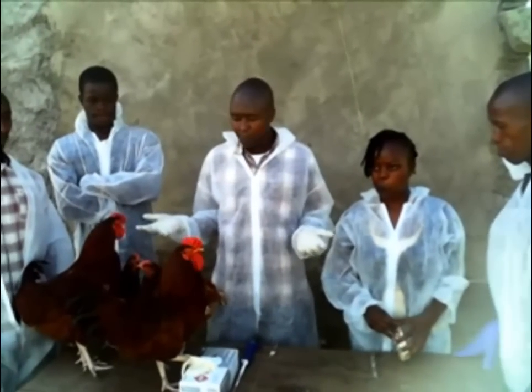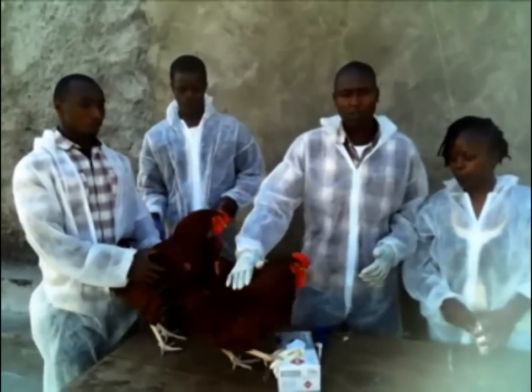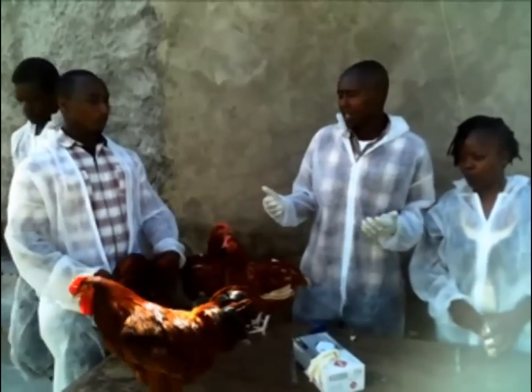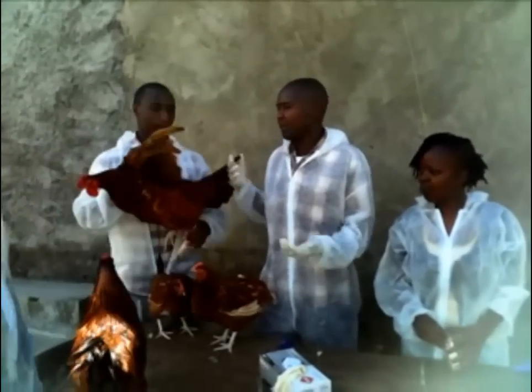So now let's go. First, get your cocks from the cages. Make sure that when you are handling the cocks, you minimize the stress, because if the stress is high, you cannot be able to get the semen.